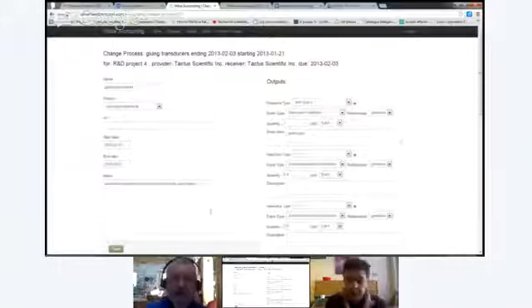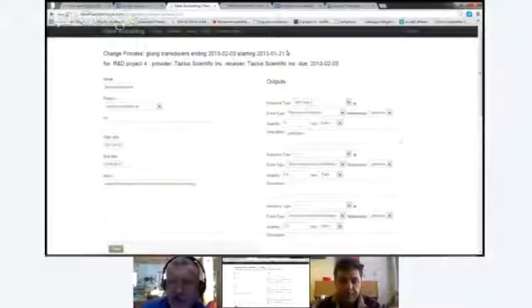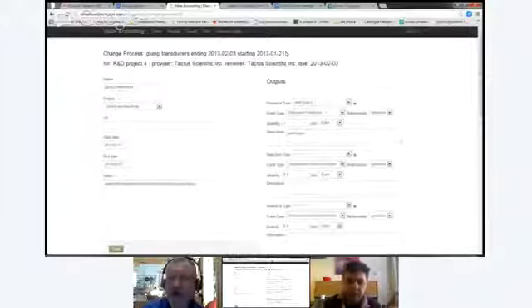So you may want to require that, so that you can create an association with a person and a type of work even if they haven't done it before, but you would have to create that for them after they had done some training. We may want to have something in the system that says this is the process for getting qualified to do that type of work. Exactly.